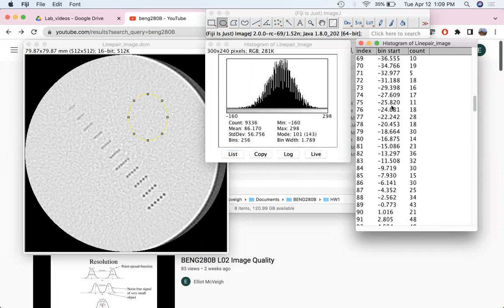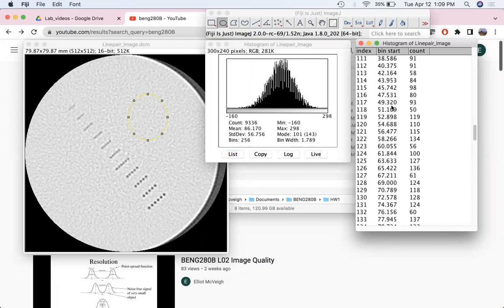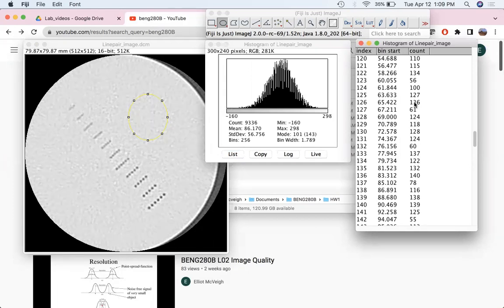And then as we go to the middle of the histogram, here we can see at 127 around here, we're getting more counts inside these bins. You can see there's some kind of artifact created by the fact the bins are a little too narrow. But it gives you a nice picture of the breadth of the pixel values in this field.